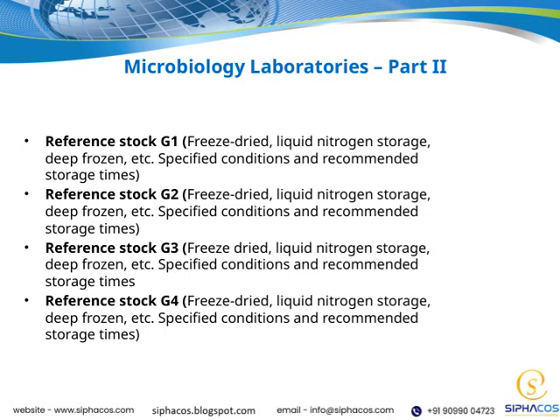Now, let's take a closer look at the reference stocks, G1 through G4. These are typically freeze-dried, stored in liquid nitrogen, or kept deep frozen, depending on the specific requirements.